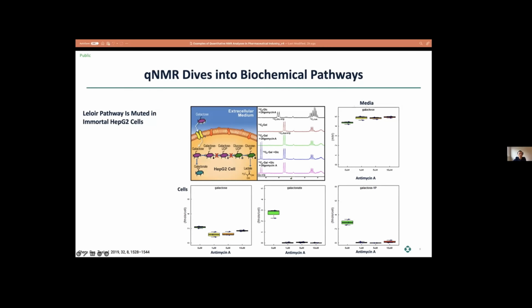What we found interesting was that if you have glucose, just like any cancer cell, they will metabolize the glucose undergoing anaerobic glycolysis, which means that most of the products did not enter into the TCA cycle, but just go purely to glycolysis and end up as lactate. But if we feed the galactose, what we found is that in the cells, we didn't see it converted into glucose, nothing converted even into lactic acid.